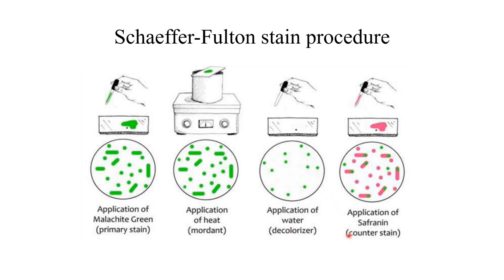Next, we will add the counterstain, that is safranin. And after adding the safranin, we will keep it for 1 minute, and we will wash the slide with water. After drying, we will observe the smear under the oil immersion microscope.